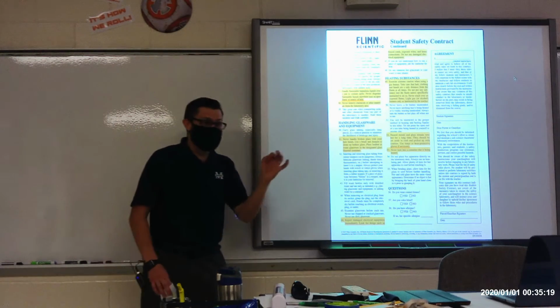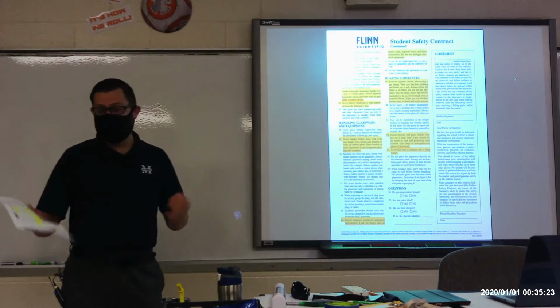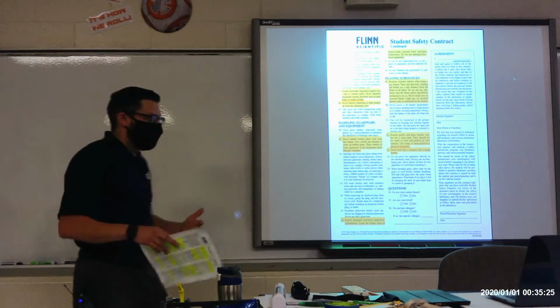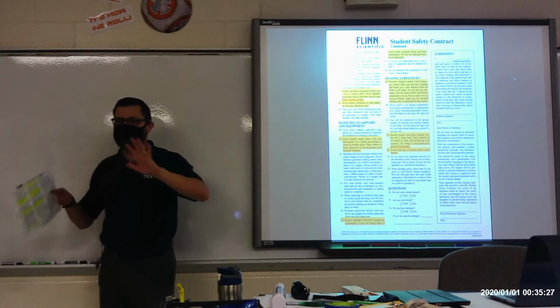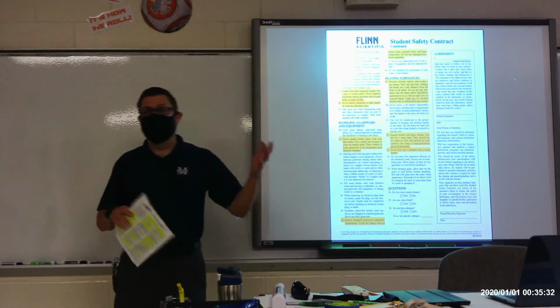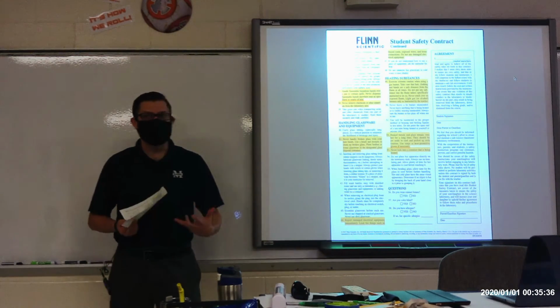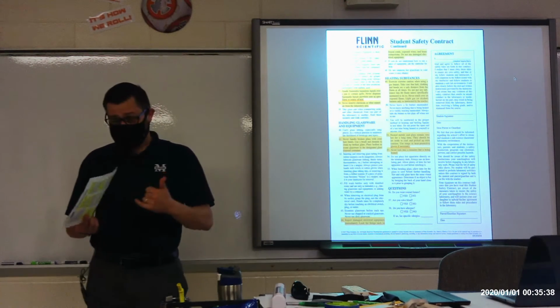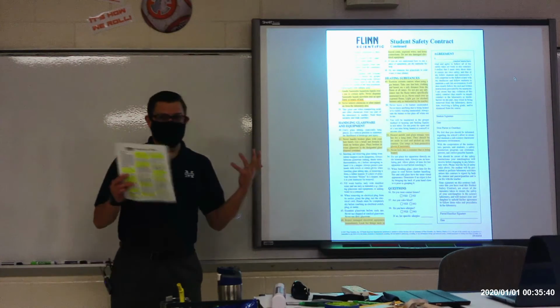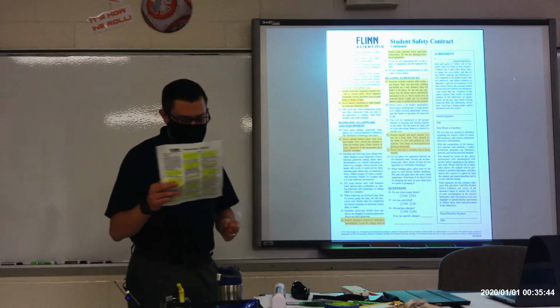So if you see any broken glass, if anything is chipped or cracked, that's number 41 here. If you see any broken glass, please let me know. It may have cracked or chipped and I may not have noticed it, or possibly somebody broke it last class period and just decided not to tell me because they didn't want to get in trouble. But the important thing is we don't want to cut ourselves on glass pieces. That's no fun.